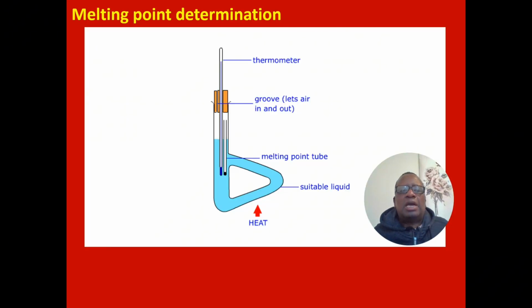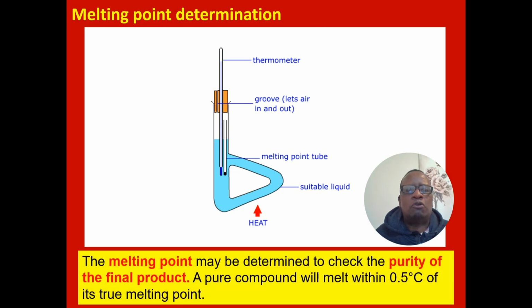Right, another process that's very important is determining melting point. After students had made aspirin, to compare, they determine the melting point. Your diagram or your apparatus could be slightly different from the one shown on my screen. But once you determine the melting point, you then compare with the melting point of pure product or pure aspirin.